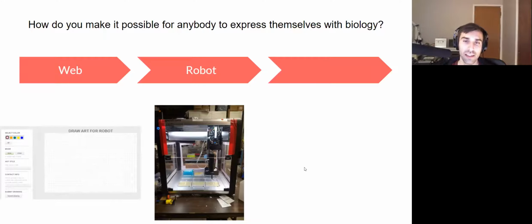And we've also talked a lot about trying to look at different ways of handling expression here. There hasn't been a ton of work on this, to be honest, but it's definitely something that we're thinking about in the next phase. It's like, okay, well, how could we change the copy number in a plasmid to produce different intensities of color if you wanted to do some shading or something like that? Or it could also be done, how do you make the biology interact with itself? Maybe it does some kind of quorum sensing, so it can be one of the artists in the piece of work.